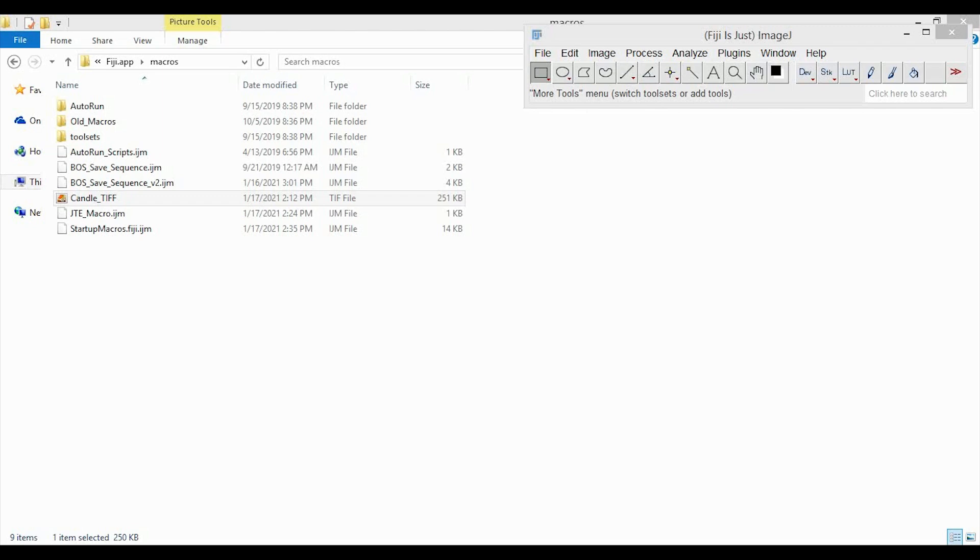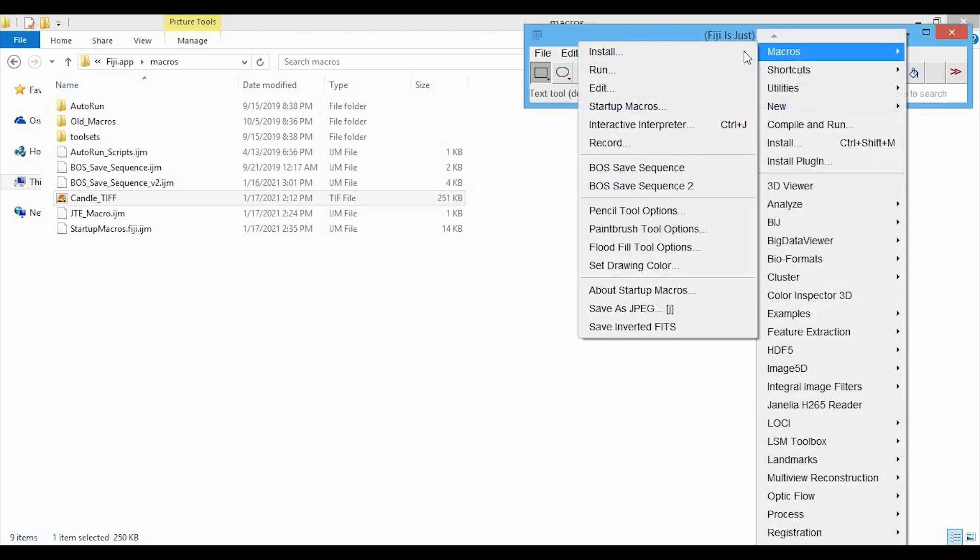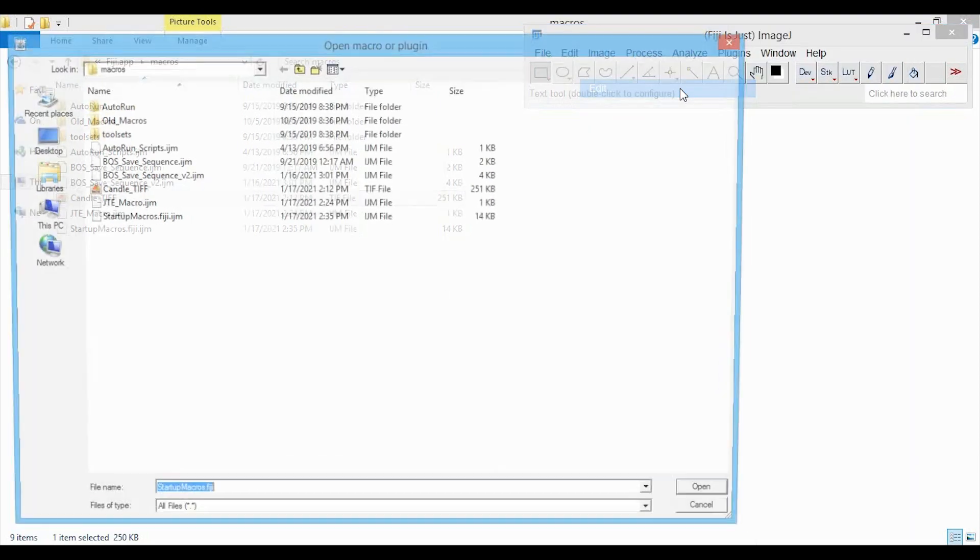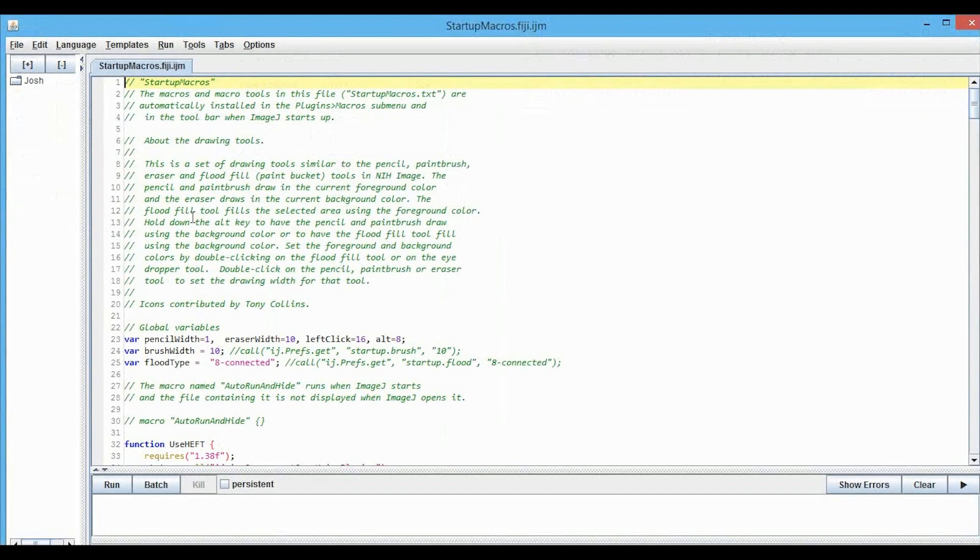We just need to add the macro code to the startup macro file, and we will again navigate to Plugins, Macros, Edit, and we'll open up the startupmacros.fiji.ijm file.